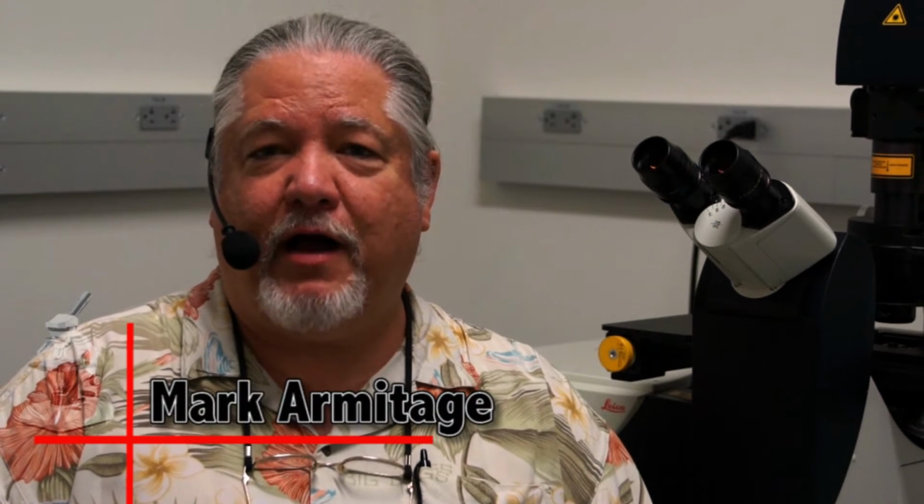Hello, this is Mark Armitage coming to you from the microscopy facility in the biology department at California State University, Northridge. We welcome you to this series of training videos in confocal microscopy. The purpose of these videos is to train you on the Leica SP5 confocal microscope, which you will be using during your experiments for your projects.